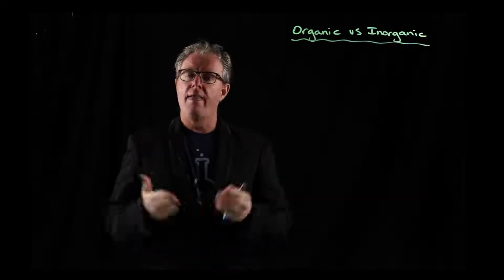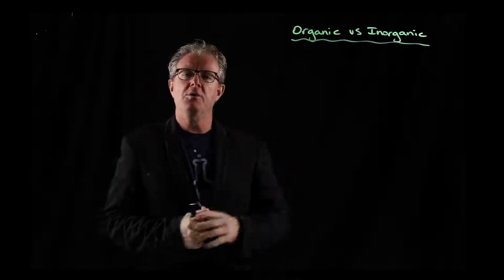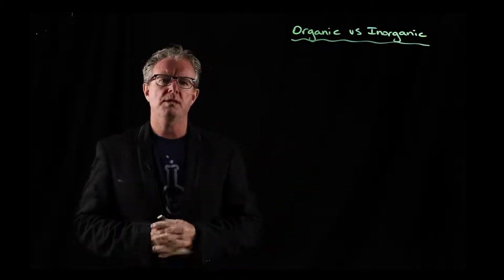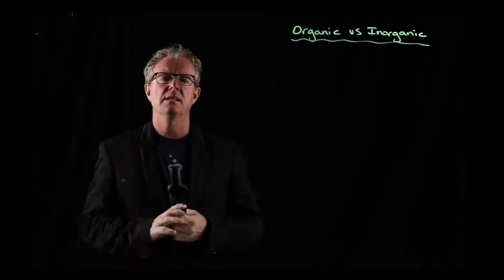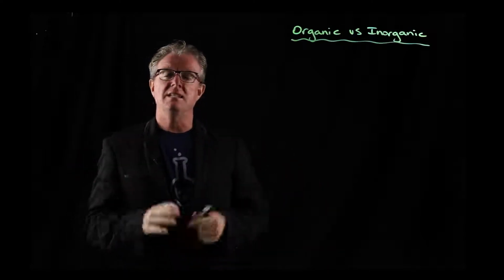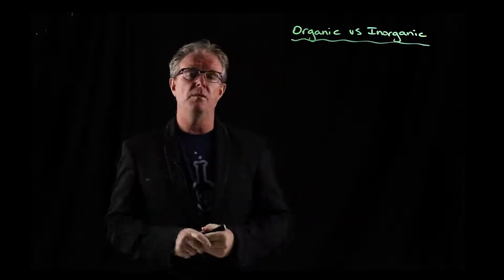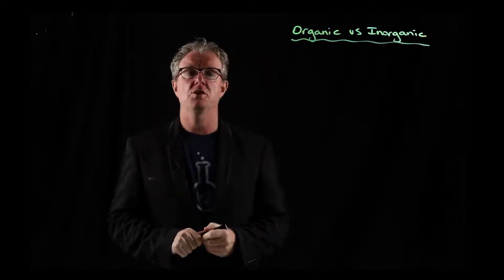Organic or inorganic? That is the question. So we're going to be looking at how forensic chemists distinguish between these two classes of compounds, because when evidence is collected, the fundamental question is: is it organic evidence or is it inorganic evidence? In the school lab anyway, we do very simple tests to determine that.